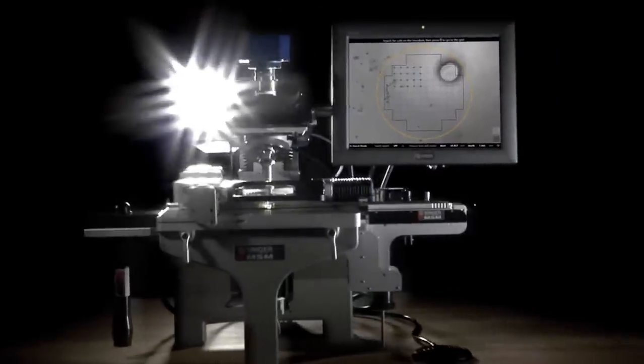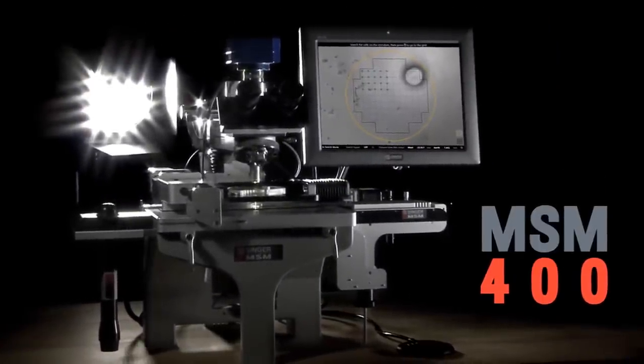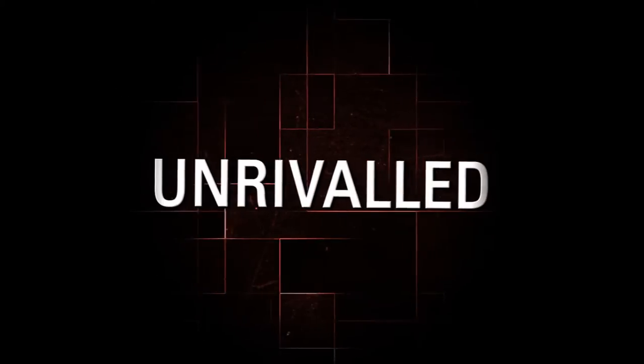The MSM 400. The most sophisticated yeast dissection workstation ever built. Powerful. Intelligent. Unrivaled.